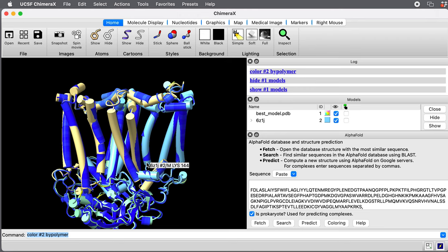Another limitation is that Google Colab can limit the time that you are allowed to connect to their server. The maximum is 12 hours, but they can terminate your job sooner than that. So the run may not complete if you're running a long sequence, a total sequence length that's say more than 800 amino acids. Even if it might have enough memory, you might run out of time and Google shuts it down.